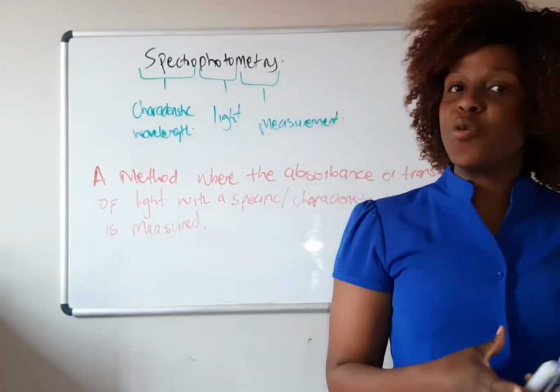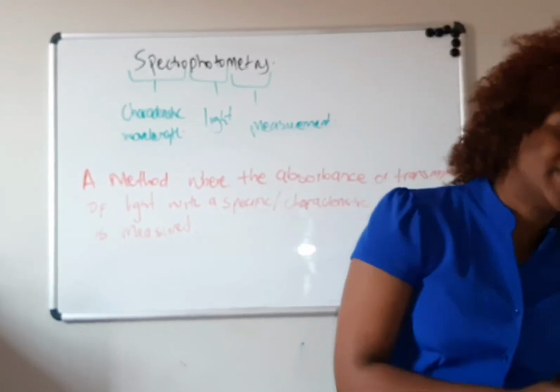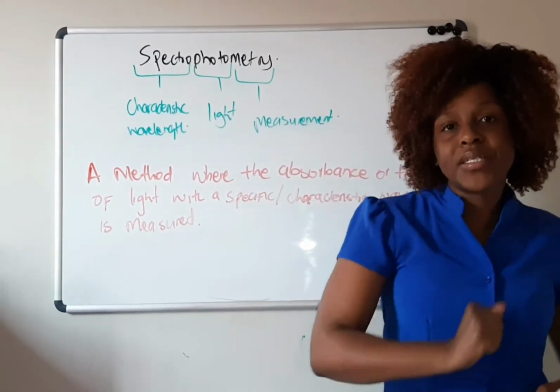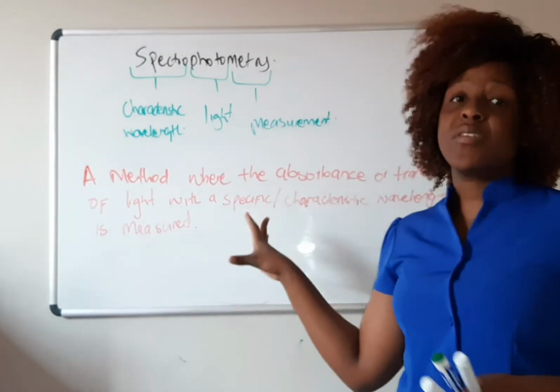If you get any question, or if you are being asked what is spectrophotometry, and you feel like you are forgetting a little bit, it's much easier if you dissect the word into its components, and then you can put the words together to define that specific term.